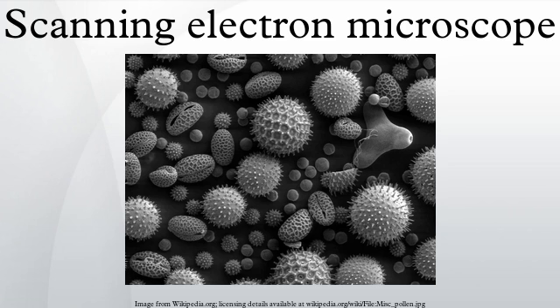In the most common or standard detection mode, secondary electron imaging or SEI, the SEM can produce very high-resolution images of a sample surface, revealing details less than 1 nanometer in size. Due to the very narrow electron beam, SEM micrographs have a large depth of field yielding a characteristic three-dimensional appearance useful for understanding the surface structure of a sample. This is exemplified by the micrograph of pollen shown above. A wide range of magnifications is possible, from about 10 times to more than 500,000 times, about 250 times the magnification limit of the best light microscopes.